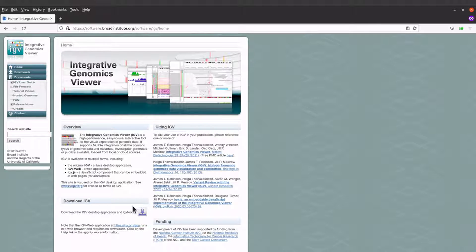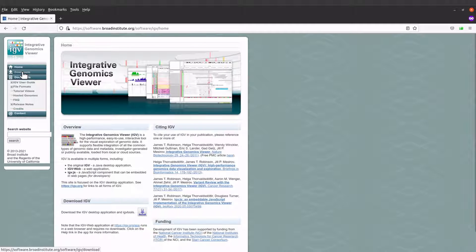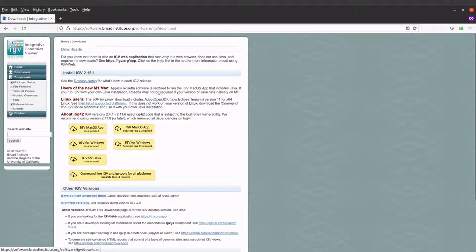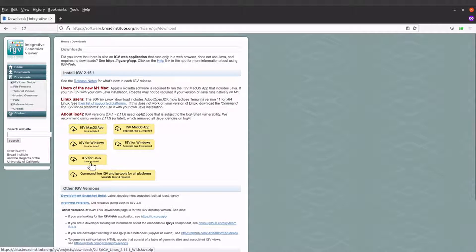For this tutorial we are going to download the binaries. On the download page you will see different versions of IGV. We are going to download the Linux version — this one comes packaged with Java, so you don't need to install Java, but if you already have Java installed that is also fine.